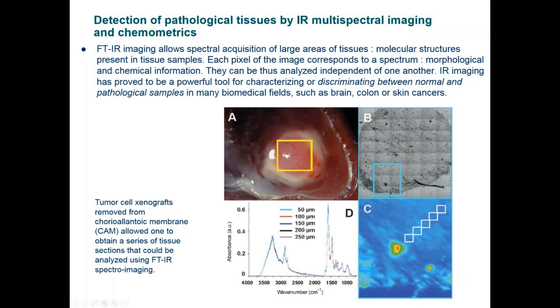And in this case, I think it's sampling for the presence of proteins as well as different types of polysaccharides or glycoprotein interaction that can be diagnosed or analyzed from this spectra.